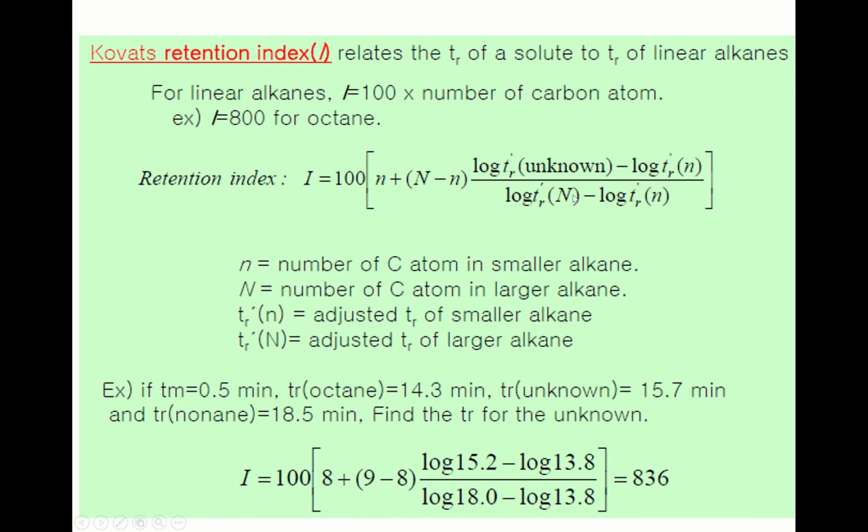Pay attention to this part. You measure the adjusted retention time for the unknown, which is tr prime.